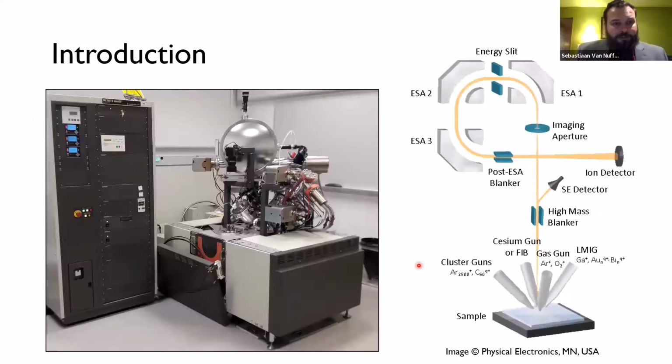And that's where our collaboration started, because TOF-SIMS, time-of-flight secondary ion mass spectrometry, is capable of label-free chemical imaging with the same kind of spatial resolution as an optical microscope. It's capable of imaging elements, inorganic materials, organic compounds, and a lot of different biomolecules. It's especially good for relatively small molecules, such as lipids and metabolites. It's also capable of looking at drugs and toxins. It's not good for large biopolymers, such as proteins and DNA. They tend to fragment into their building blocks.